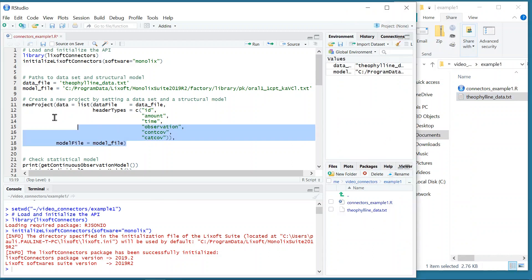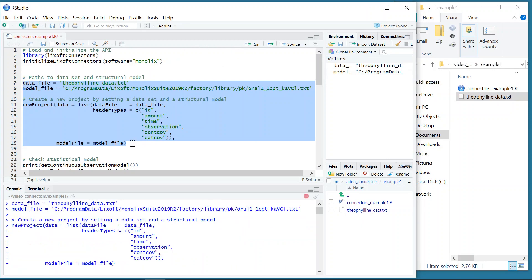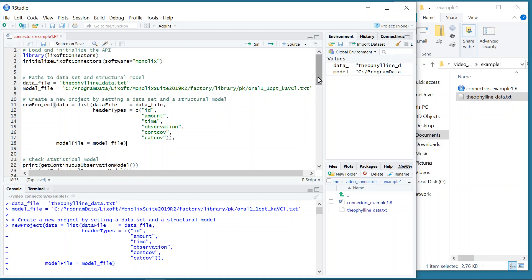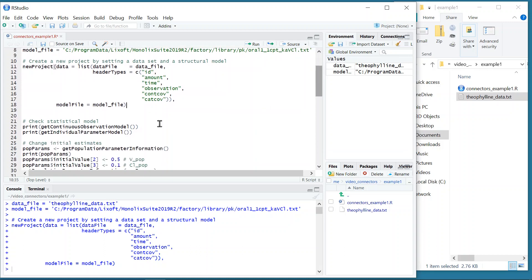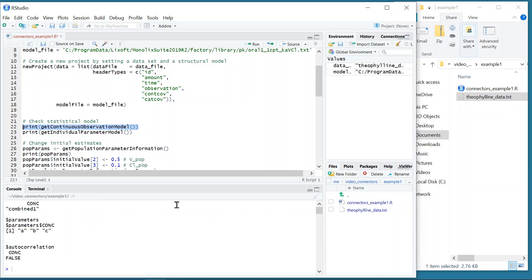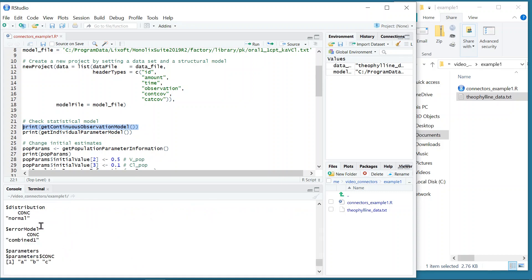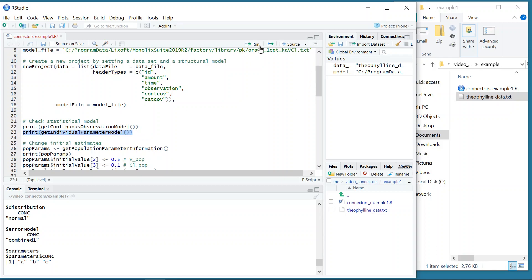When I execute this, the new project is created with the default settings, initial estimates, and statistical model. I can check the default statistical model with several functions, like getContinuousObservationModel, which shows that the default observation model has a normal distribution and a combined one error model, or getIndividualParameterModel, which shows the models for the individual parameters.